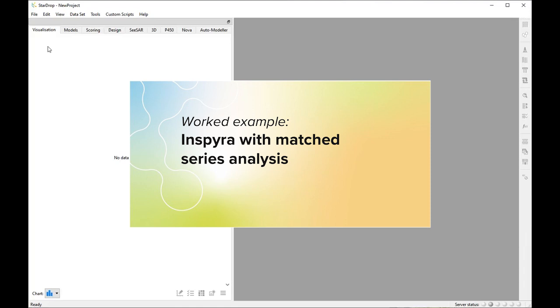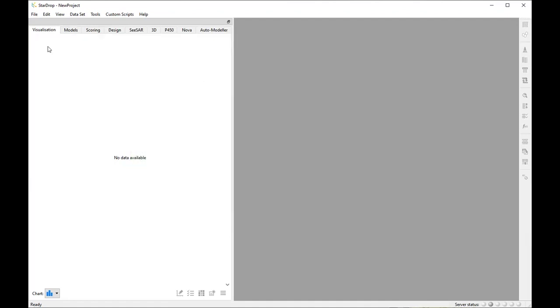In this work example, we will explore ways to use the Inspyra panel in combination with match series analysis. If you're not familiar with Inspyra, take a look at this video for an introduction. Match series analysis goes beyond match pair analysis and uses longer series of matched compounds to propose new substitutions that are likely to improve activity.